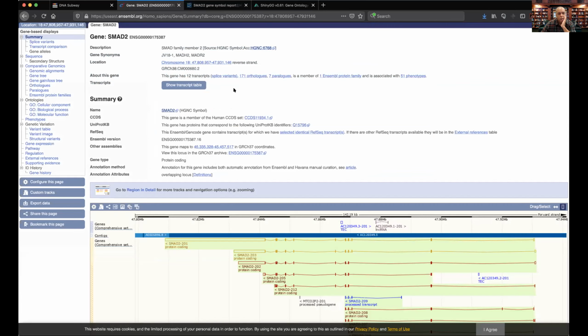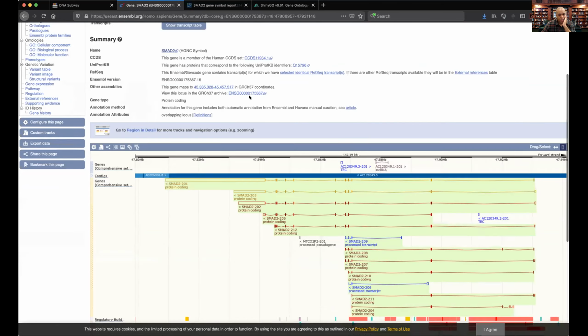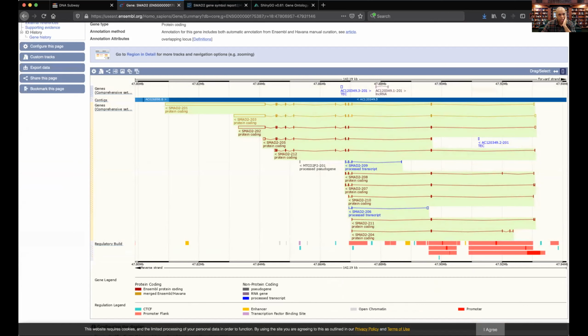But for right now, one of the questions is, why should I pick that one or any one of them? How do I actually know? But certainly it's pretty cool, I think, that you can go ahead and just by that look at it.